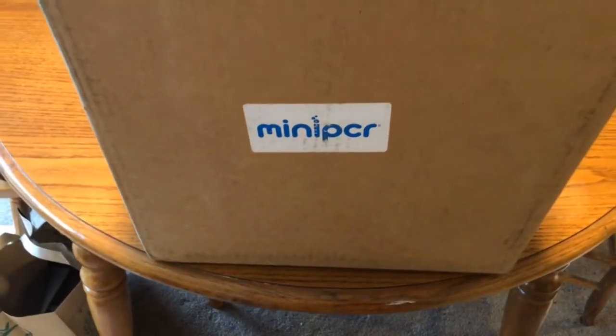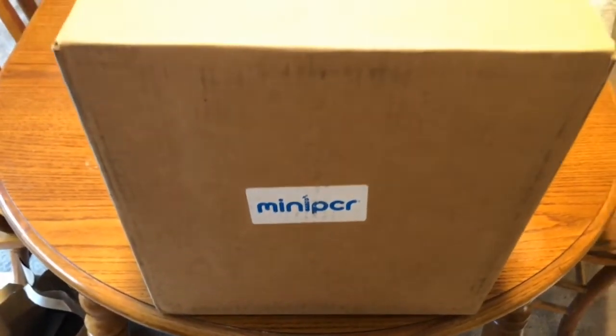All right folks, we got the mini PCR. I'm gonna be doing an unboxing — we got one of the lab kits.